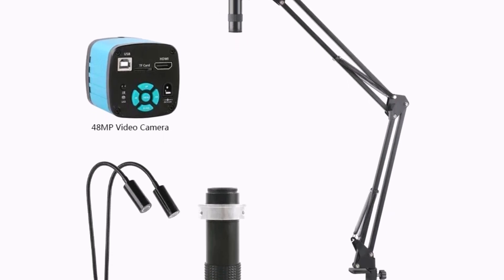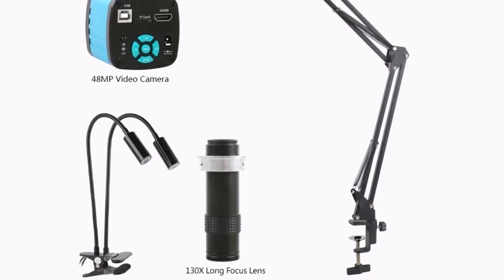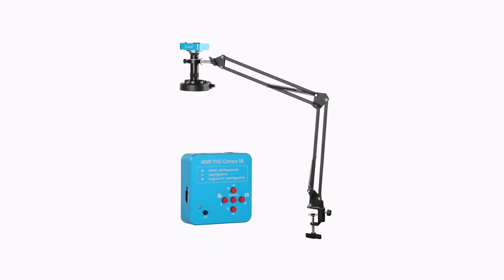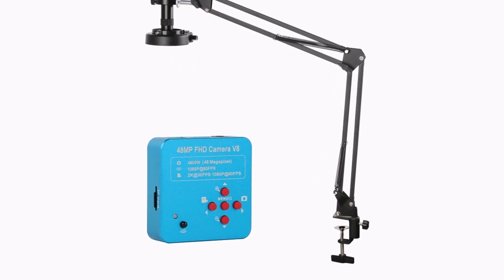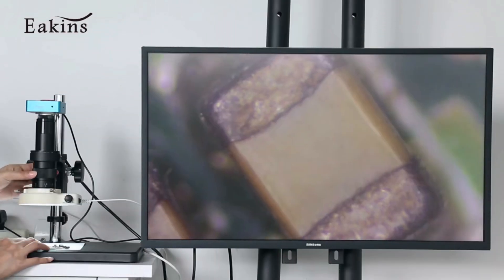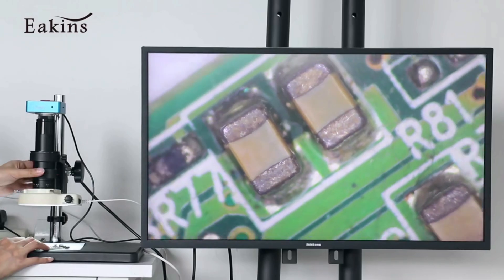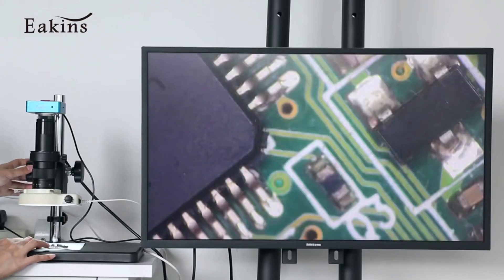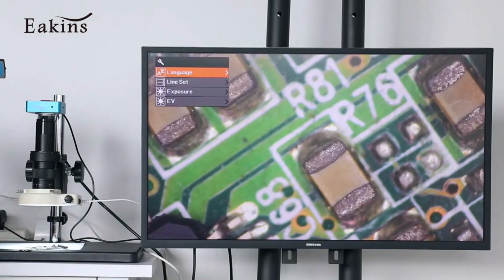The solid aluminum body adds durability, and the compact, portable design makes it ideal for professionals and hobbyists alike. If you're looking for a high-resolution digital microscope that's versatile and easy to use, the Aikens 48MP 4K HDMI-USB Microscope Camera is a fantastic choice. It combines excellent image quality with flexibility, making it a reliable tool for anyone involved in detailed visual inspection or digital documentation.